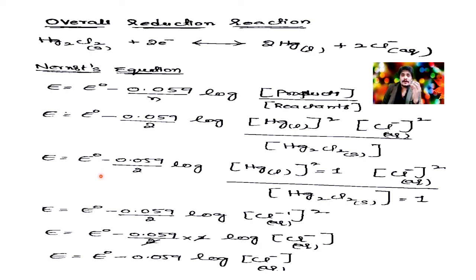That is, we have to consider the activity of the solids and the liquids as unity, and consider only the value of the ions.